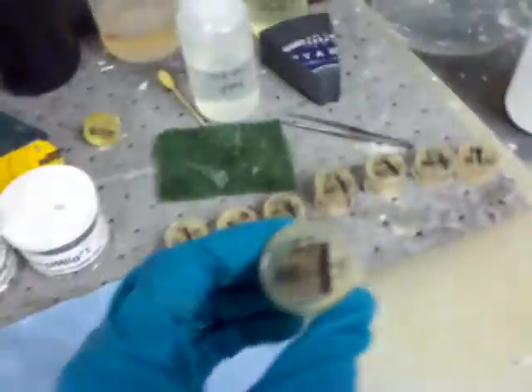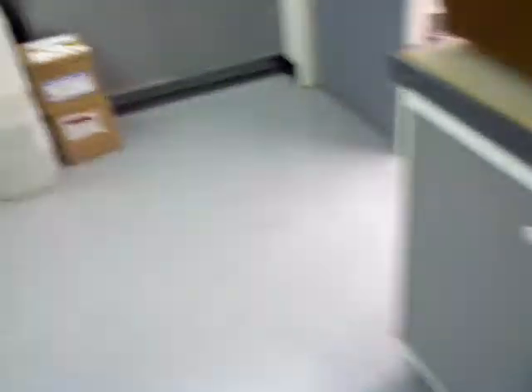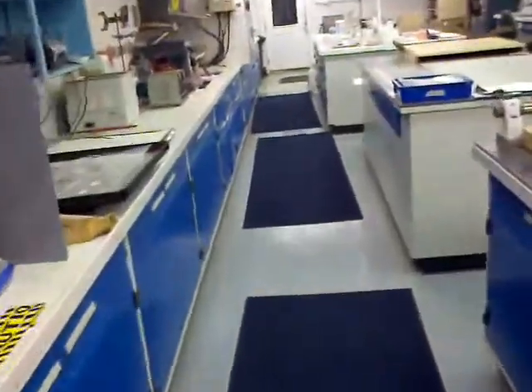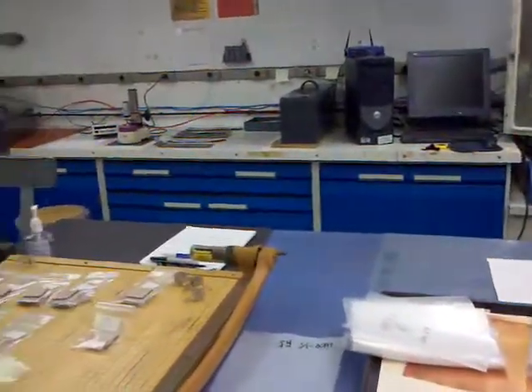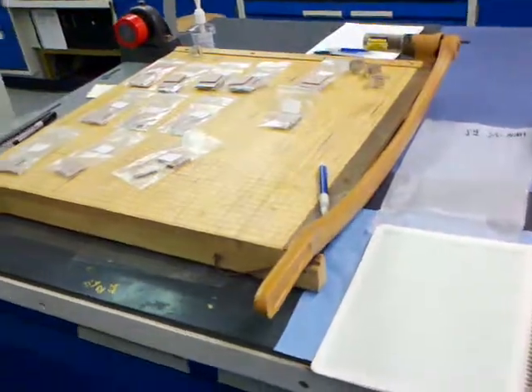You saw a finished product — these come out of those over there on top of the little mini fridge. Once you take this, I'm not going to take this video recording upstairs, but there's a microscope up there and we look at it and take a picture after that. Basically this is what my day consists of. There's a bunch of other neat stuff in here, but I really haven't gotten that much of an introduction to it. They need this project done as soon as possible.